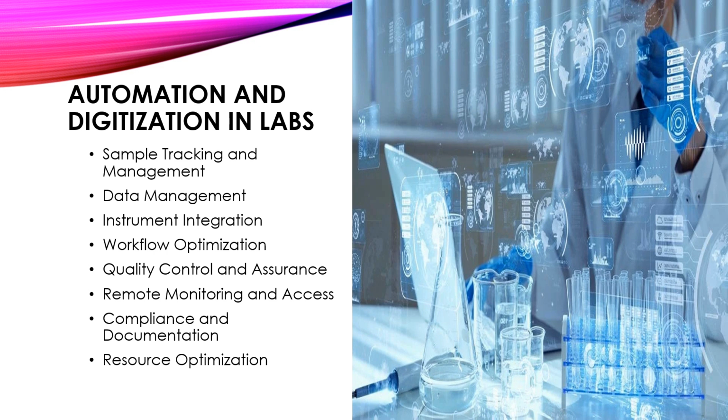The last but not the least is resource optimization. Automation helps optimize resource utilization by scheduling instrument usage, managing inventory levels, and tracking equipment maintenance schedules. And this ensures that laboratory resources are used efficiently, reducing costs and improving productivity.